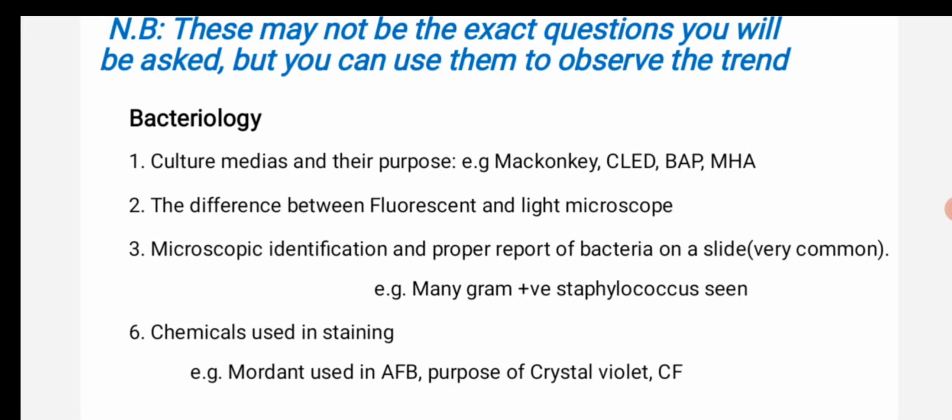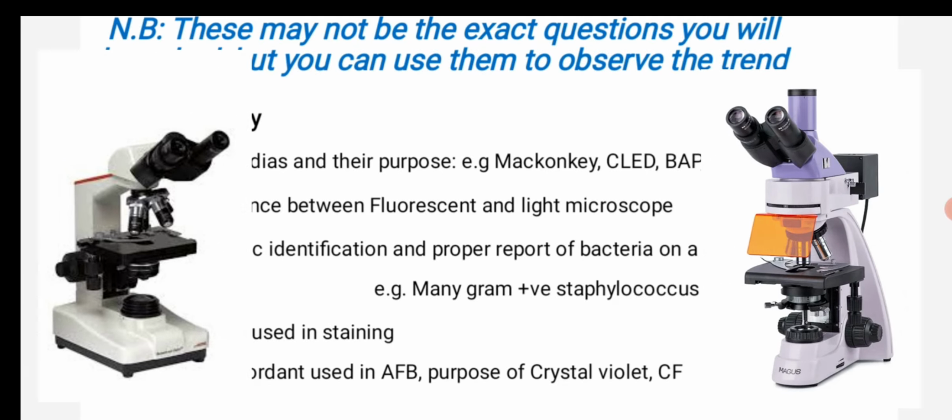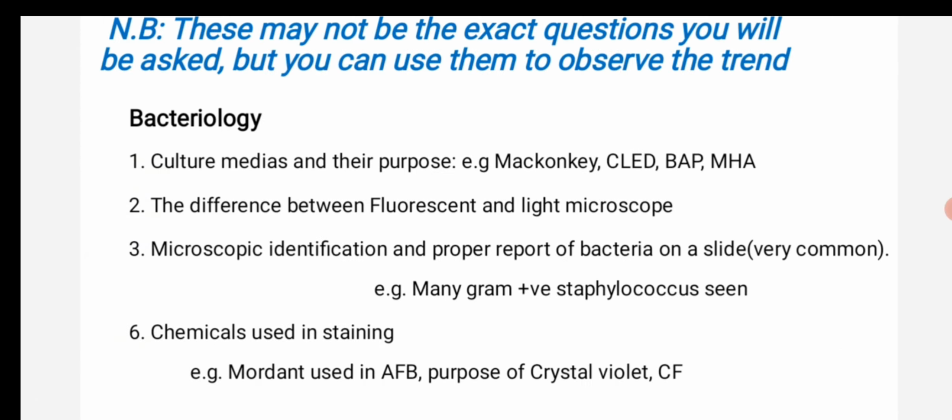This is very common. The second thing is we have to identify the difference between fluorescent and light microscopes. This is also very common. We have to identify in terms of sensitivity, specificity, as well as resolution and magnification. For example, the fluorescent microscope uses UV light, right? But the light microscope usually uses ordinary light.